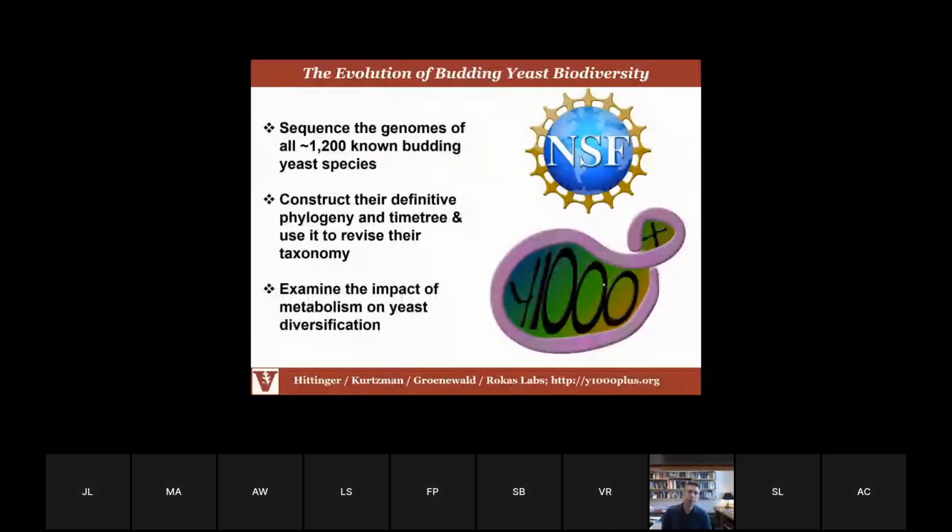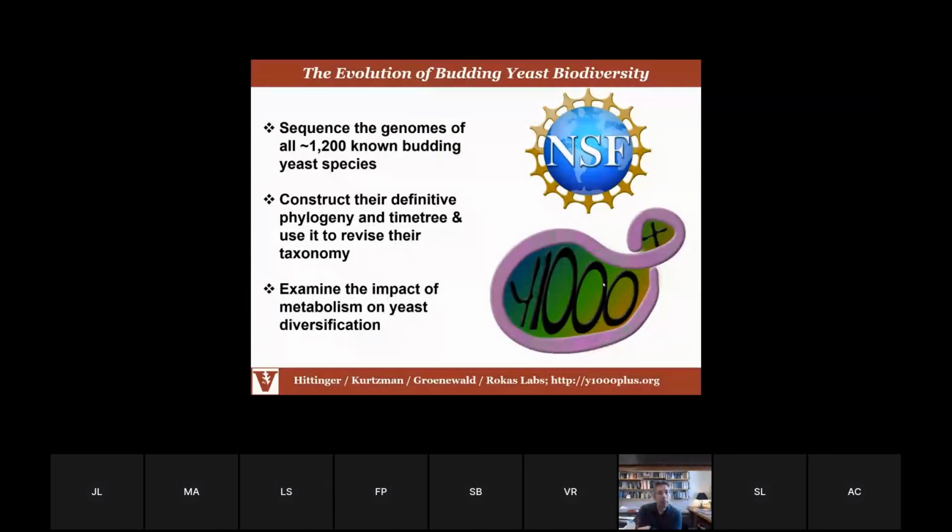interesting evolutionary stories. And so the project we're involved with, and the project that I want to tell you about, is a project focusing on budding yeast, and I'll explain in a minute what budding yeasts are. And so the idea was to sequence the genomes of one representative, typically a type strain, of all 1,200 known species of budding yeast, construct their definitive phylogeny and time tree, and use that knowledge of phylogeny to revise their taxonomy. And then, given that yeast lifestyle is largely based on metabolism, to examine the impact of metabolic diversity on yeast diversification.